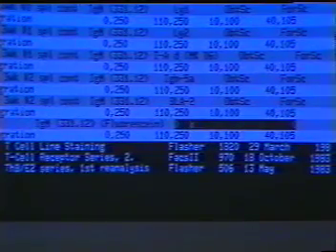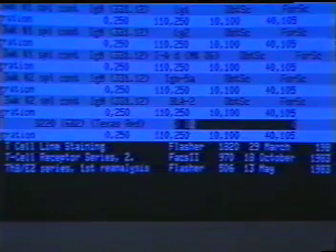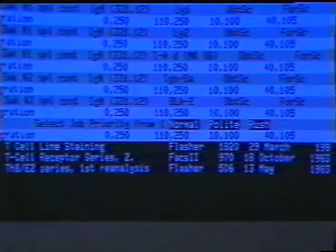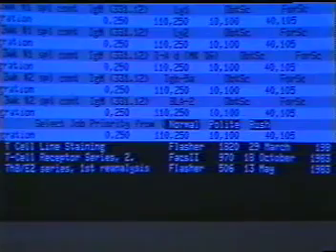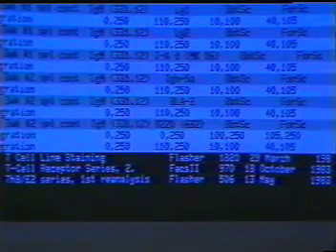In the following example, we'll submit an integration analysis with rush priority. We respond to each of the required sensor prompts. Then, after entering a set of gates for the last parameter, we press Tab to progress to the optional priority prompt. We position the cursor next to the rush option, then press Return or Tab to complete the analysis request. When you give a job rush priority, a box flashes around the word queued, indicating that the job is being processed. Only one job at a time may be given rush priority.